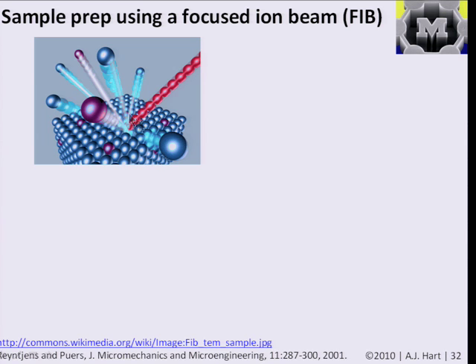One way that other types of samples are prepared: say you have something that's like a little block that you see in the SEM, and you can't necessarily put it in a liquid and shake it up and throw it on the grid. Say you want to look specifically at one place and take a little slice and then shoot the electron beam through that slice. It's really hard to do, but it's possible if you can essentially machine the material at the nanoscale. One way that's done is using a FIB, which stands for focused ion beam. This model just schematically shows the idea of hitting your material with a high energy beam of ions and throwing atoms you don't want away. So it's kind of like an ionic nanoscale water jet.